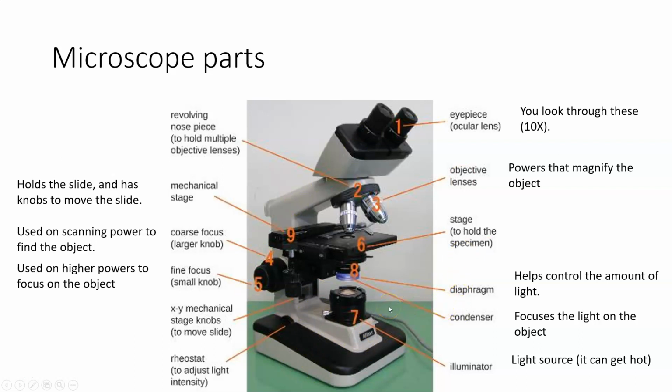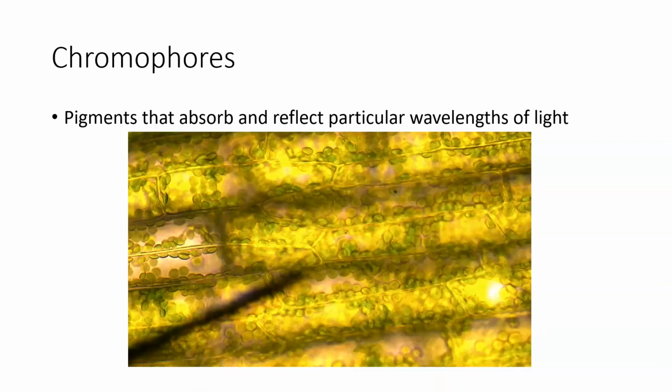Now you're going to get all of those again in lab, but I mean, it's microbiology. You can't do microbiology without a microscope. So you got to make sure you know the parts and you know how to use it. Most of the students that are coming out of freshman bio have a pretty good idea how to use a microscope, but students that are coming out of A&P, everything was already set up for you and you didn't have to do anything. And so you guys kind of have to play catch up as you come in here and try to learn those parts of a microscope.